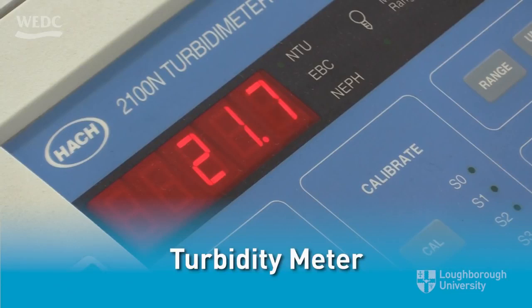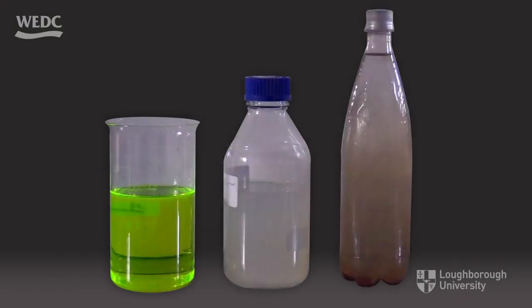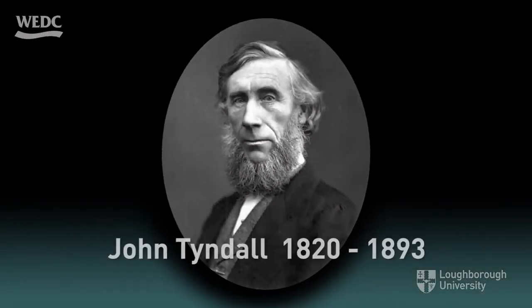The third involves the use of an electronic device that is more complex to use, but is a more accurate means of measurement. First, however, there is a rudimentary means of determining whether a liquid is a solution or a suspension by shining a light through it. This is known as the Tyndall effect. Named after the 19th century physicist John Tyndall, the Tyndall effect relates to the scattering of light by particles in a suspension.